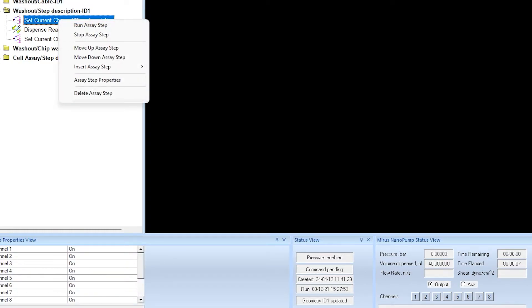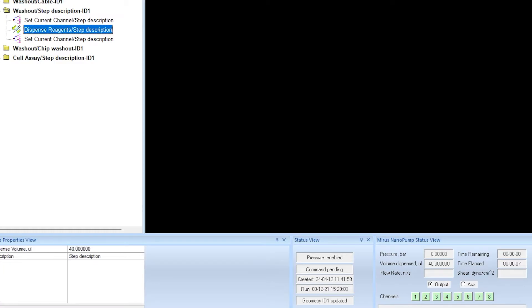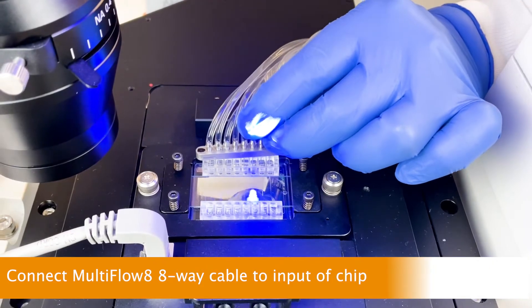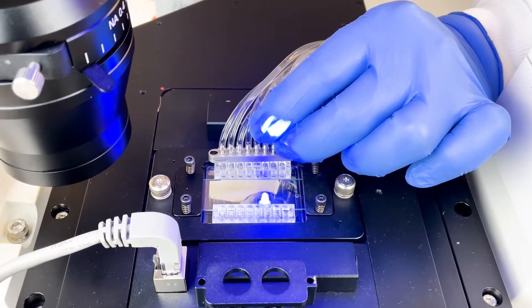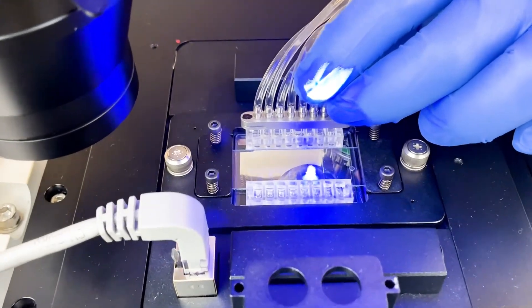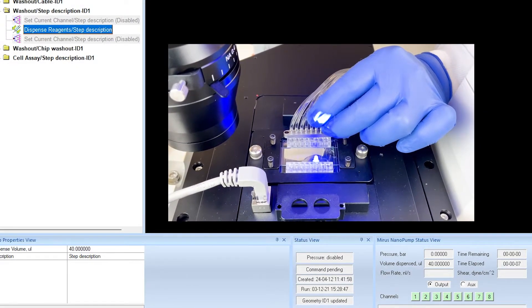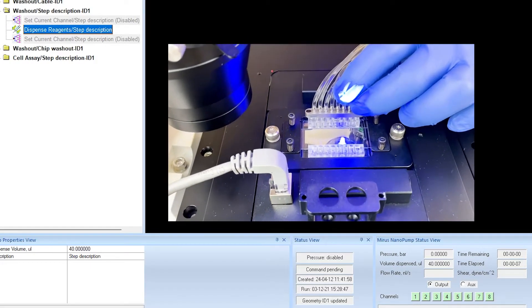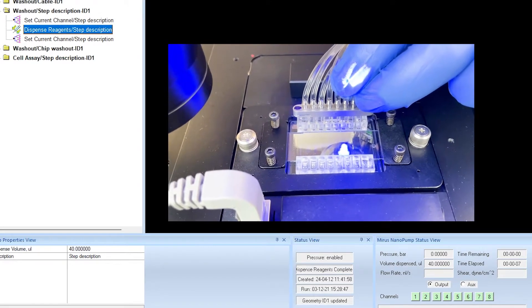Next, open all 8 channels of the Multiflow 8 by clicking the washout step as shown. This folder has an on-off command to open or close each channel. Run the command to open all 8 channels. Place the output of the 8-way cable at the input ports of the chip — don't plug it in yet. Hold it in place while giving the command to dispense 40 microliters of PBS through each of the 8 channels. This primes the 8-way cable with liquid before plugging it into the input port of the chip, preventing bubbles from getting into the chip.